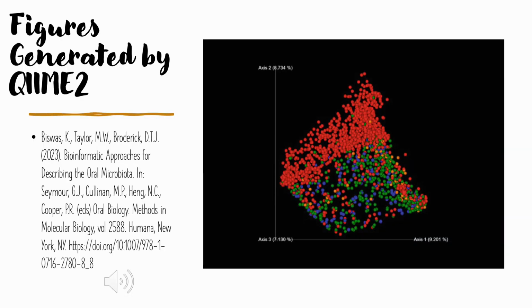Okay, and this last figure is from a paper on oral microbiota, which is actually really cool. I wish that I was able to show you what it would look like if I were to download this data in the file format that QIIME2 can read it in. I would take it to the website QIIME2 View, and then I would just drag and drop this graphic in there, and then I would be able to look at this data in real time.